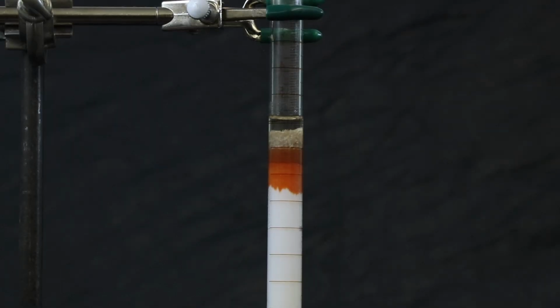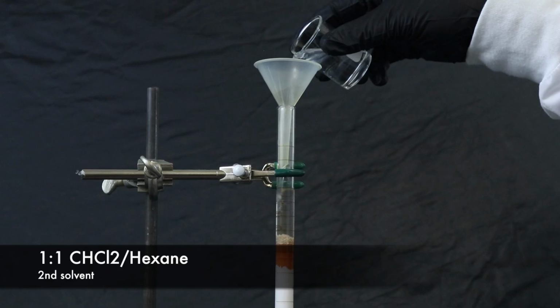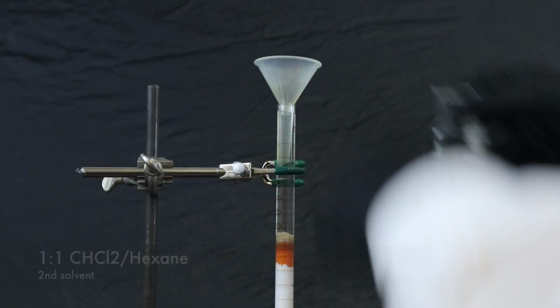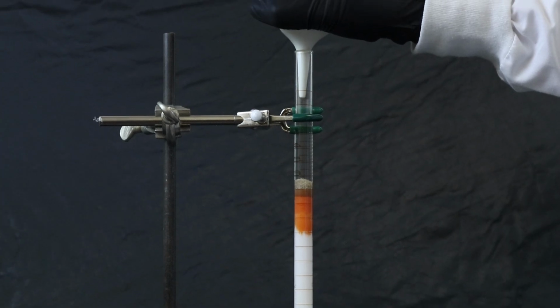And we don't want the column to run dry, so I'll replenish the current solvent or add the next one before the current solvent reaches the sand above the product. Here I'm adding the second solvent, the 1:1 methylene chloride hexane solution, and now we're going to be able to see the monoproduct start to move through the column.